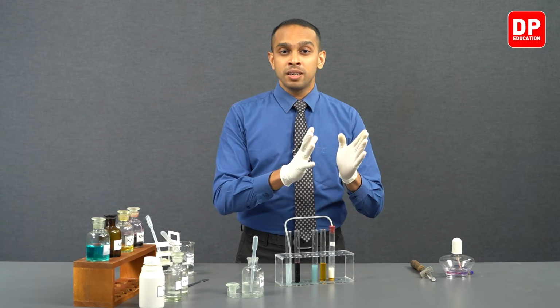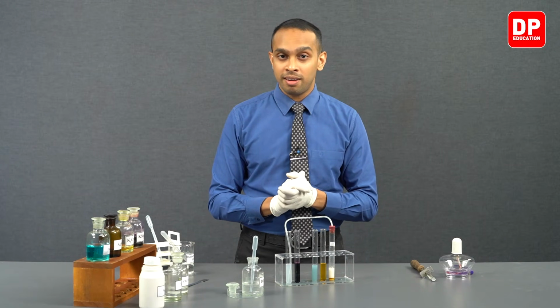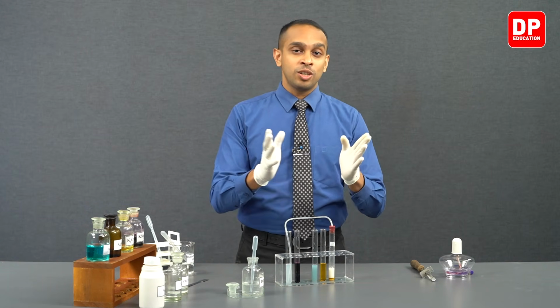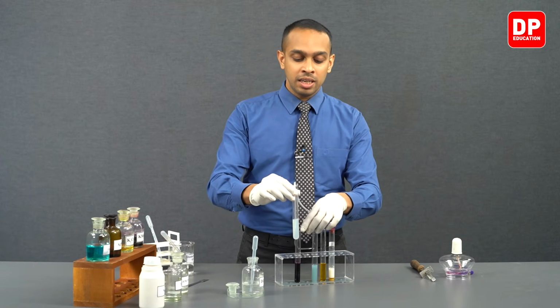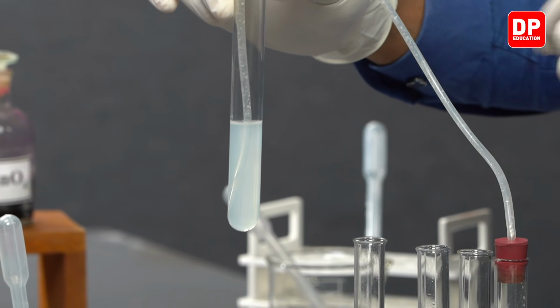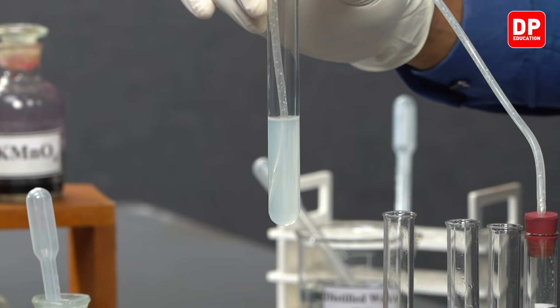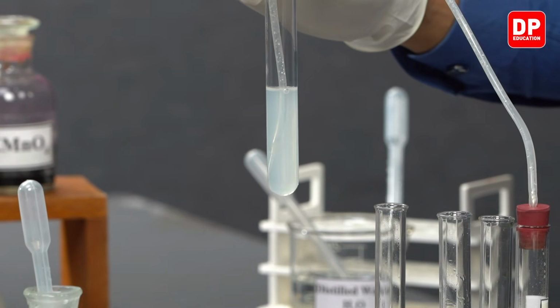We can observe the permanganate ions that are purple in color turned into Mn2+, which are colorless, and as this reduction happens, hydrogen sulfide got oxidized to form sulfur, solid sulfur in the form of colloidal sulfur, and that is why we can observe this milky nature in this clear solution that we have formed here. This is due to solid sulfur being suspended throughout the aqueous medium.